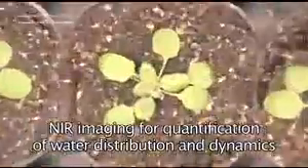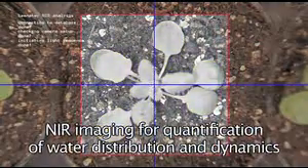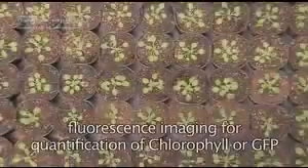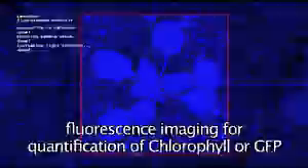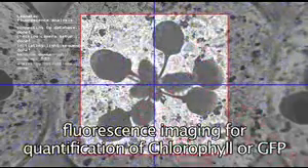Using a sequence of specialized cameras after color imaging in visible light, additional information is provided from near-infrared imaging for applications such as the specification of water status in leaf or root systems. Specific blue light illumination in combination with color imaging provides comprehensive multiple-wavelength fluorescence data for whole plants under high-throughput conditions.